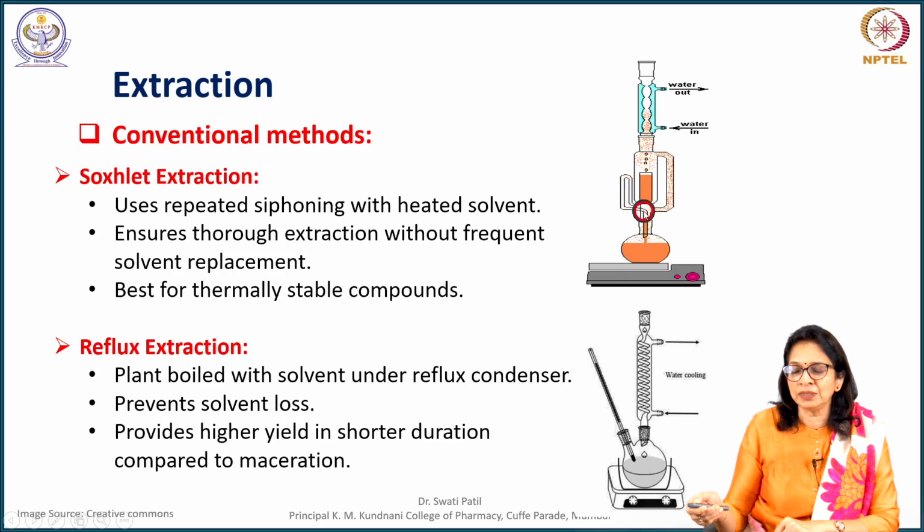So, what happens is, every time the drug is packed here in the thimble, it is exposed to pure solvent; the solvent here is rising, condensing and falling. A process of maceration and percolation also happens here. This is our drug packed.